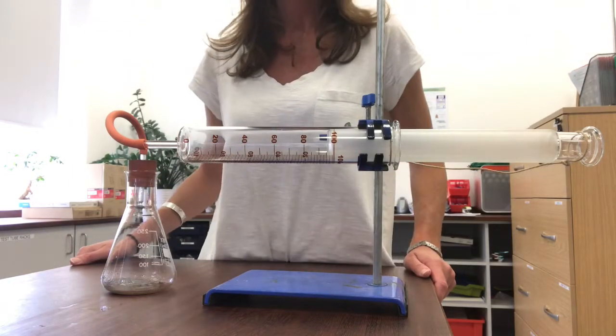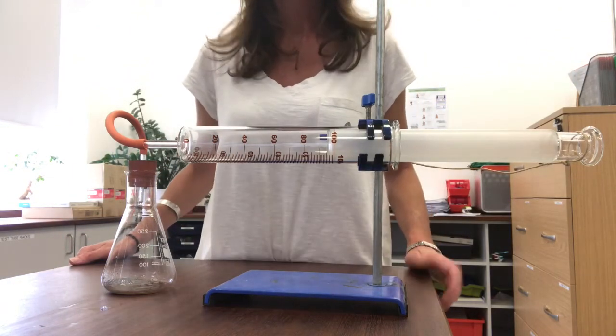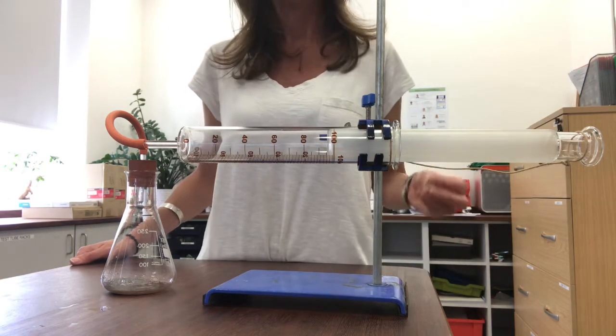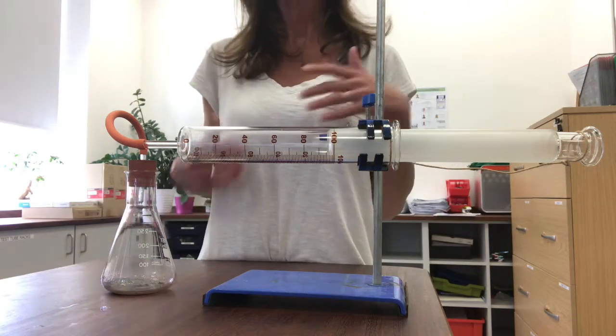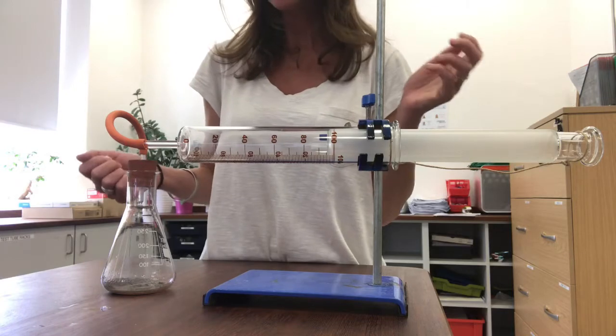Okay, this is another rusting experiment. It's slightly more complicated than the iron wool in the boiling tube. So I'm just going to talk you through it and I've made a few assumptions with it as well.